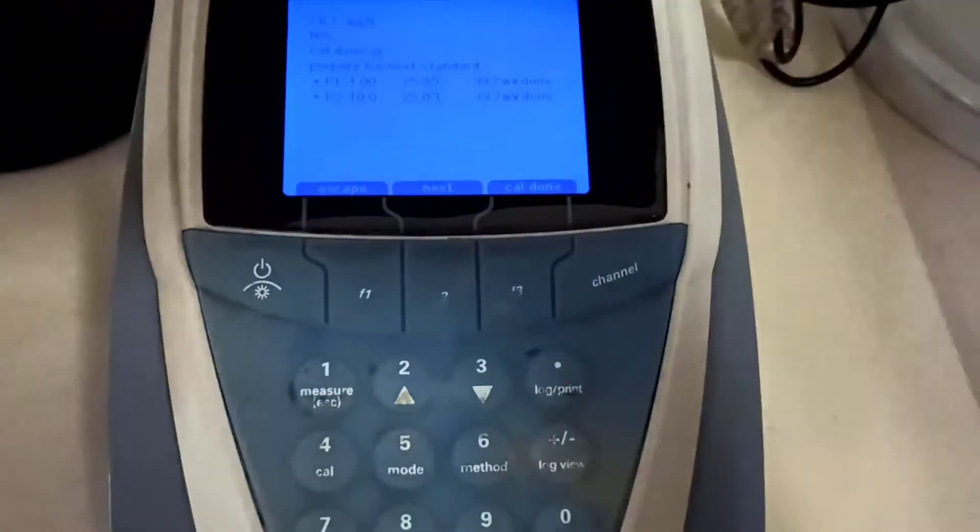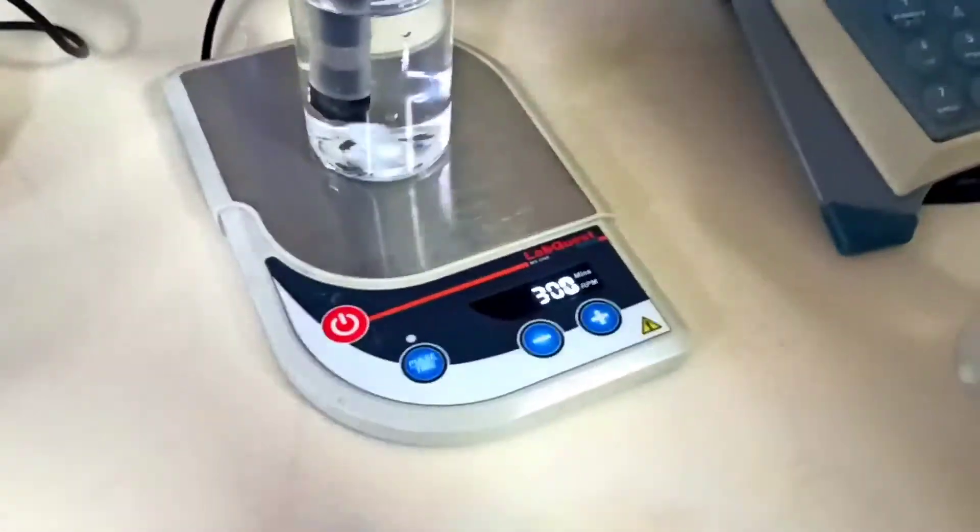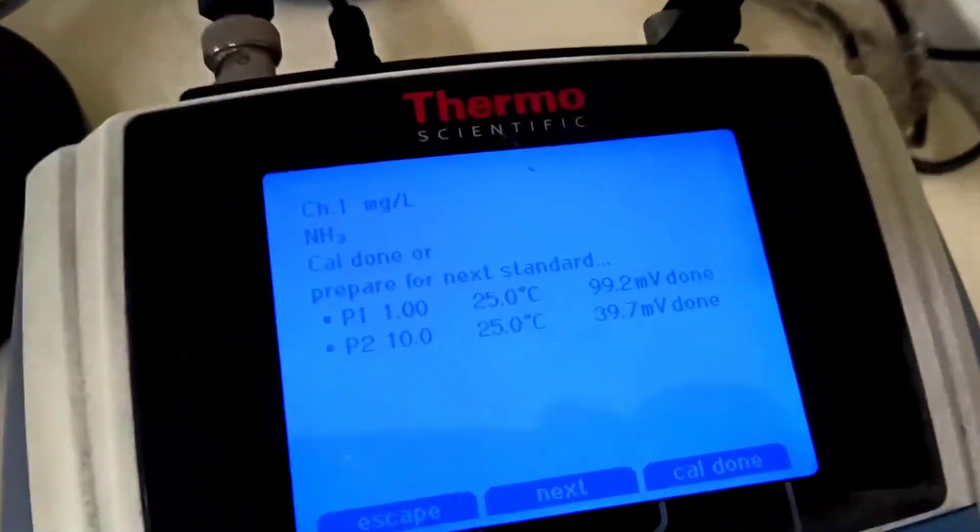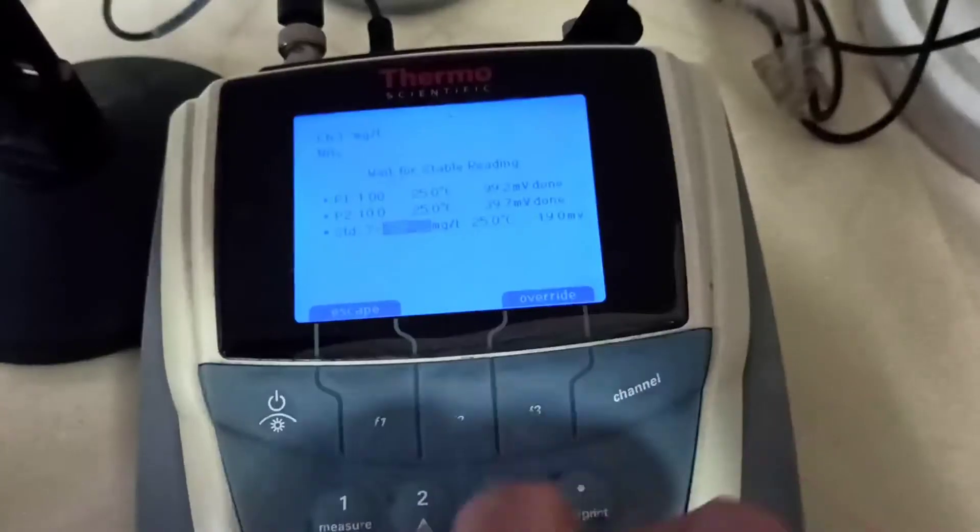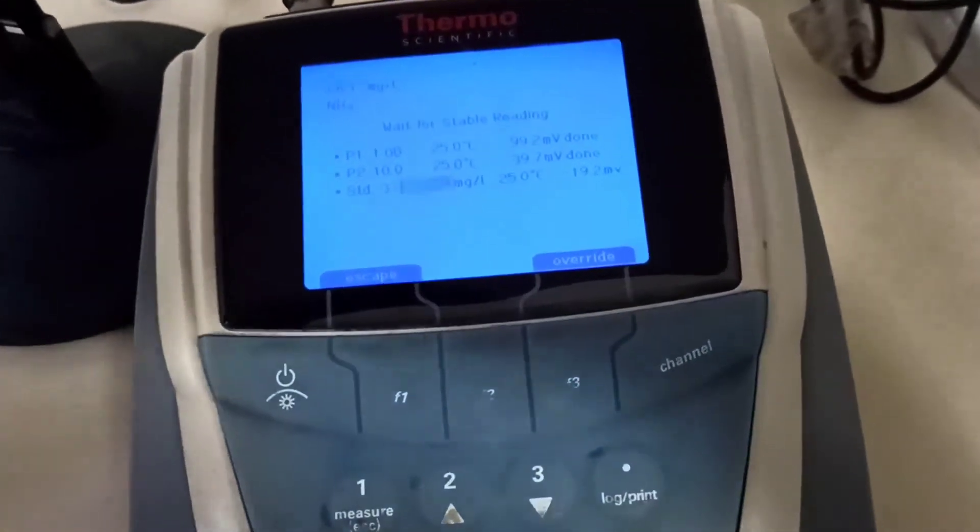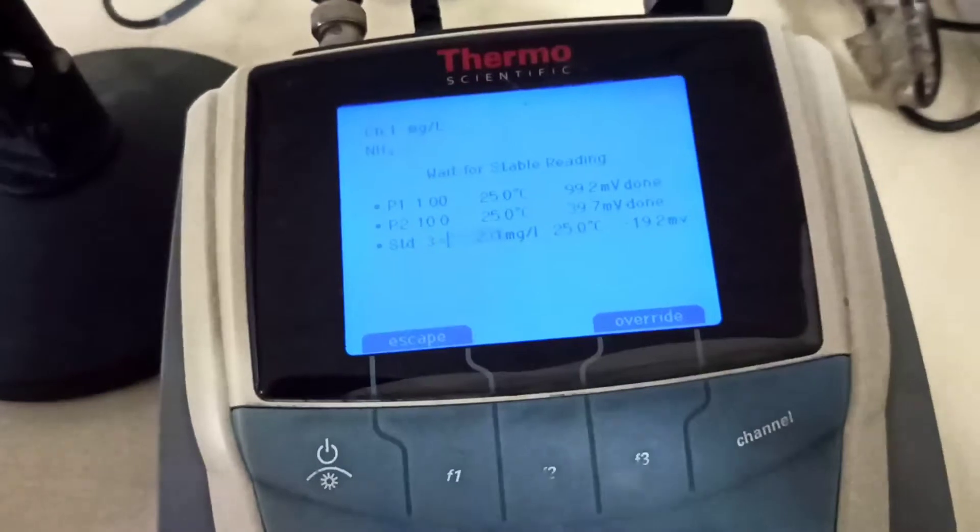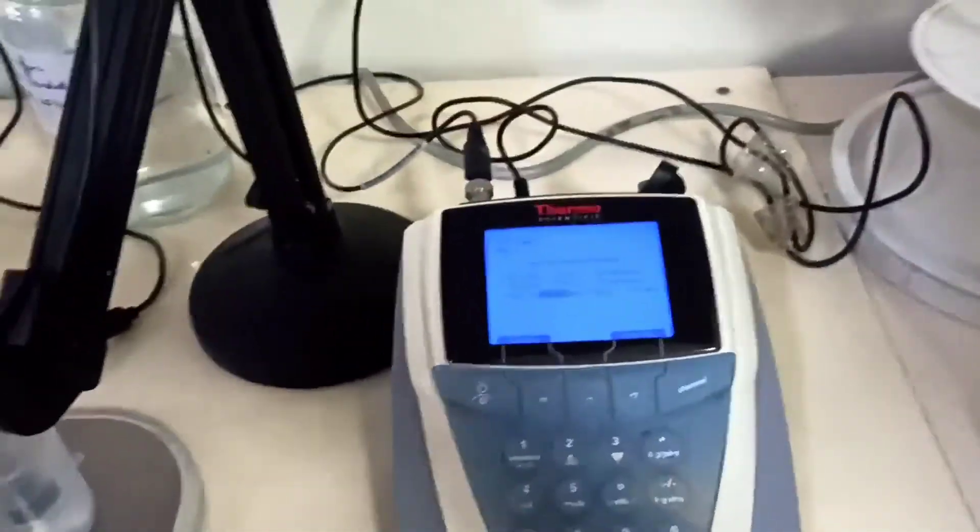We calibrate the second standard and we get 39.7 millivolt. Now we accept this reading by F2 and move to the next standard, 100 ppm. Again we are cleaning our ion selective electrode with distilled water.